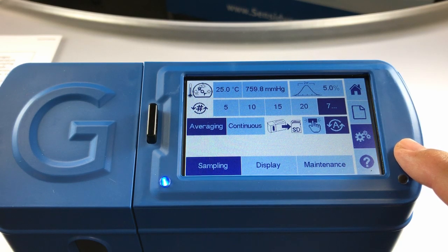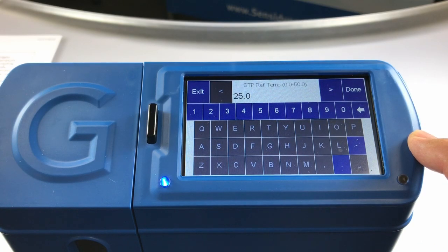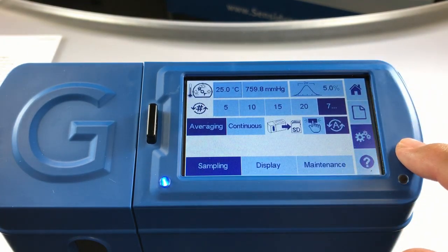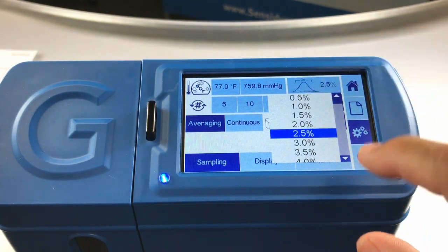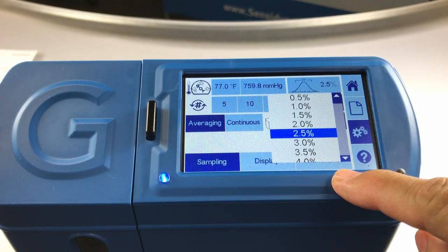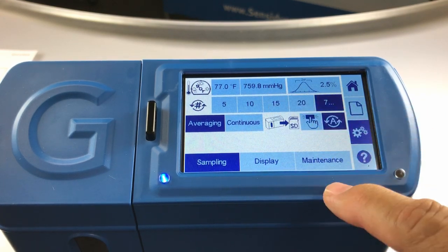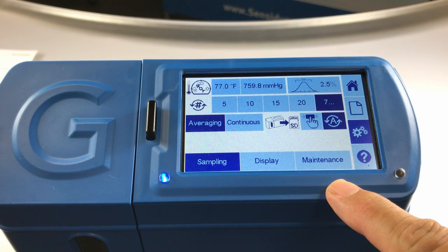You may want to convert your flow rates to a standard reference. If so, you may select reference values by pushing the buttons in the top left of the screen. A keyboard menu will appear — select the value you wish to enter and hit done when complete. Also from this screen, you may select your statistical parameters. By selecting the two sigma button in the top right, a drop-down menu will appear. You may select a value between 0.5% and 5%. For today's purposes, I will select a 2.5% threshold value. This is the percent deviation threshold, which will turn red if exceeded below the flow average on the home screen.